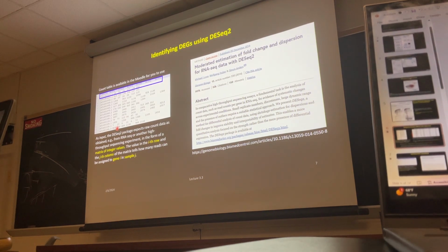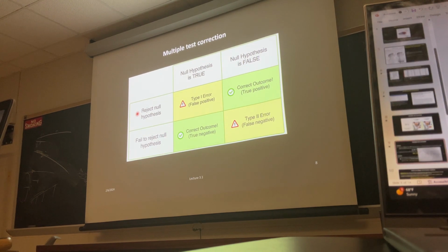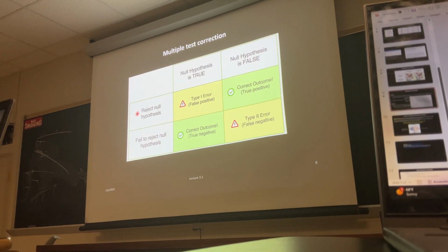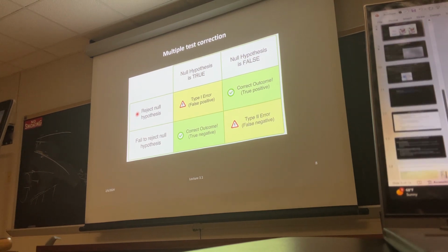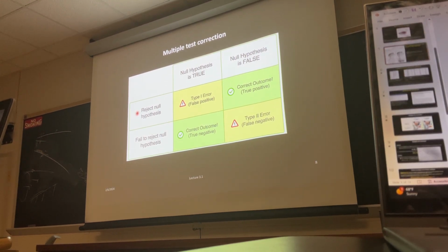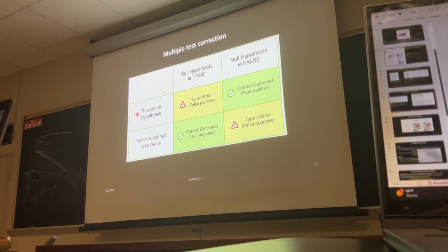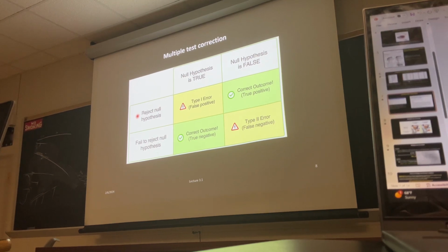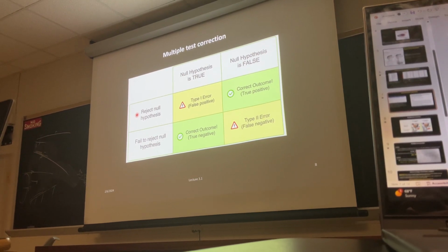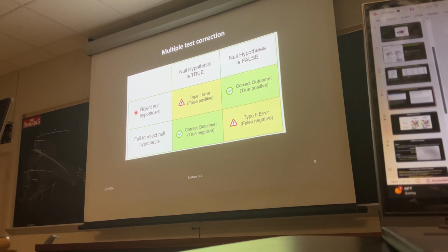So we talked about DESeq2, and these are the inputs that we used last week, right? In DESeq2, at the very last step, when we did the statistical test, there was an FDR, for false discovery rate, right? And that is from the p-value. If you see the output from DESeq2, the table, either text file or CSV file, there is one p-value column, and another one is the adjusted p-value column.